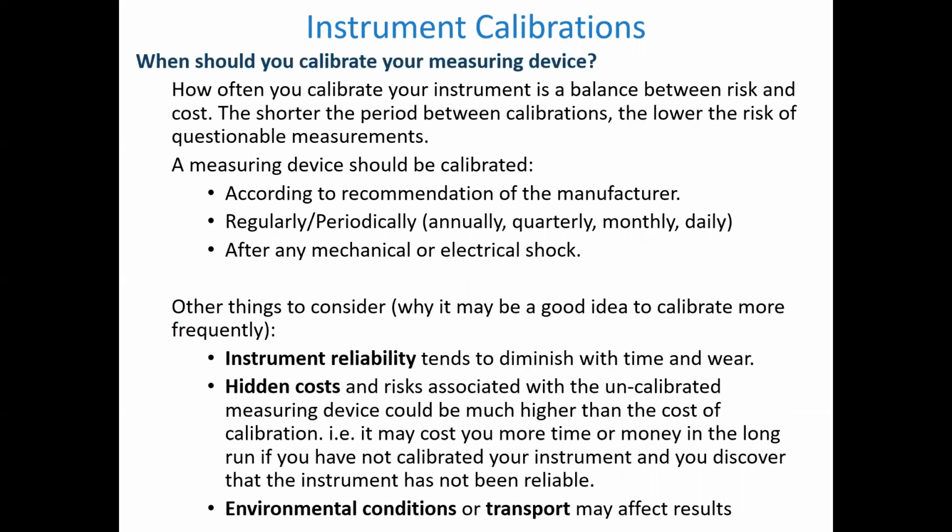pH meters should be calibrated relatively frequently, basically every time you use them. Other meters, it might say annually, it might say monthly, it kind of depends on what you need. The conductivity meters, for example, I don't think they need to be calibrated every day. I think it's recommended weekly or monthly or something like that. But it's good to know how to do them, and the solutions we have are relatively cheap, so it's good to know how to calibrate them.